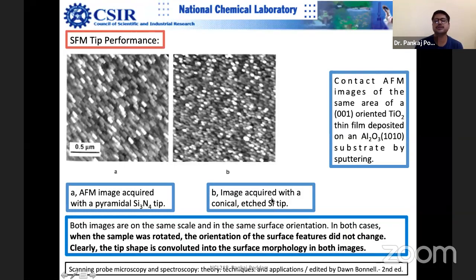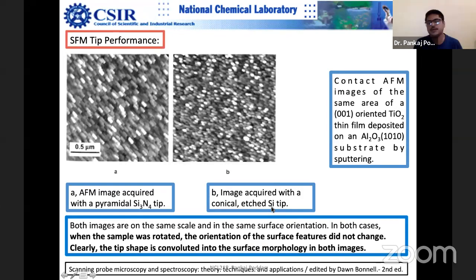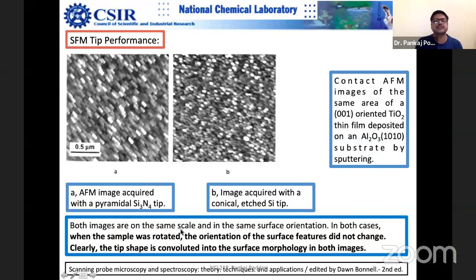Note that bar-shaped tapping mode tips can be used for contact mode, but contact mode V-shaped tips cannot be used for tapping mode — you cannot resonate the V-shape probe. Both images are on the same scale and in the same surface orientation. When the sample was rotated, the orientation of surface features did not change, clearly showing the tip shape is being imaged — this is a strong indicator of an artifact.